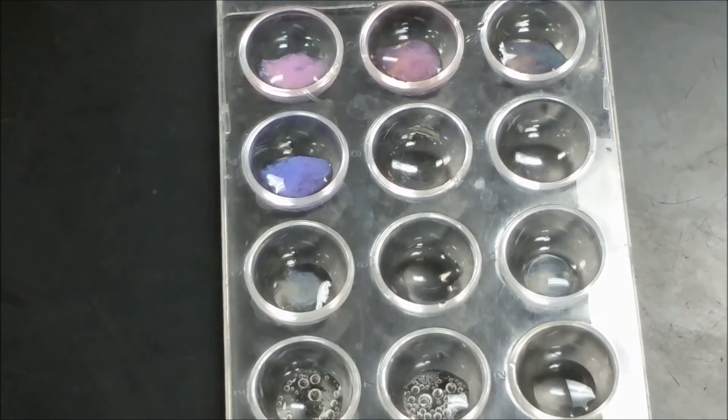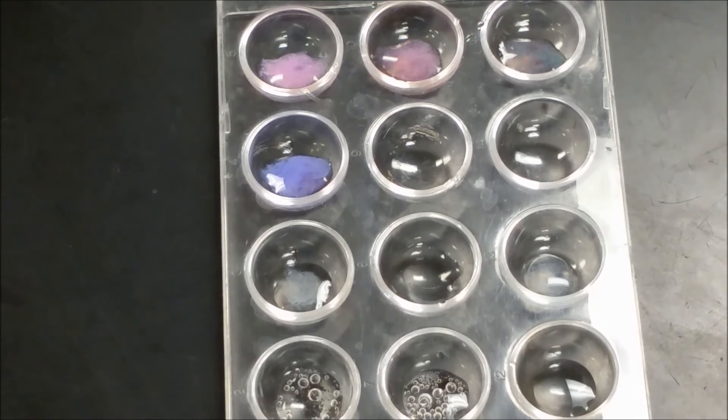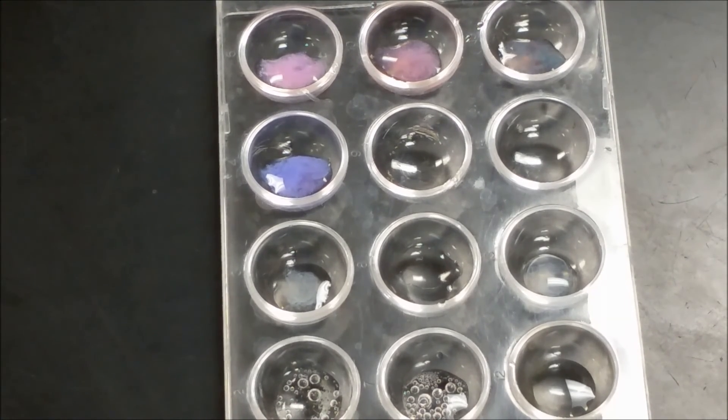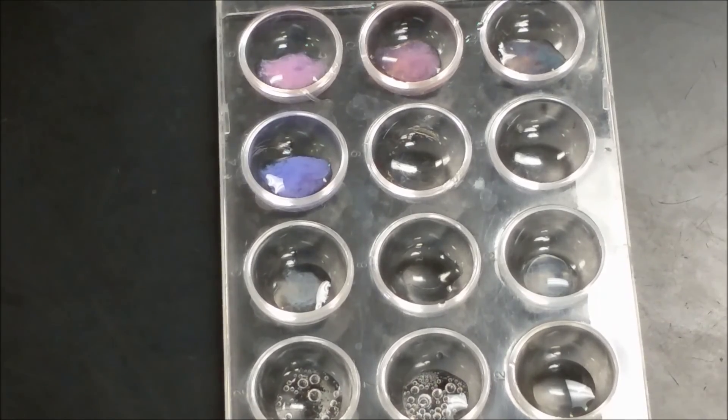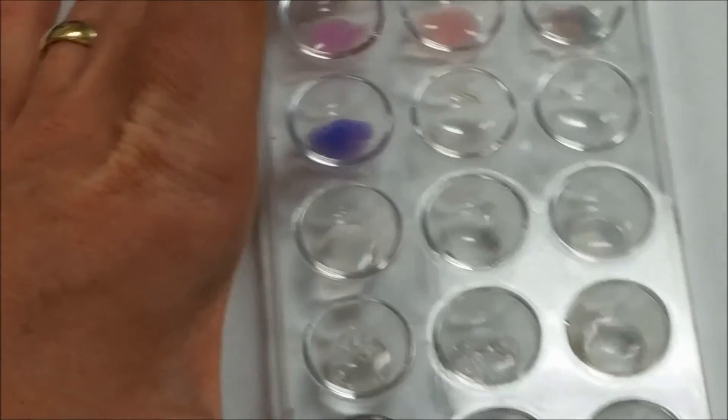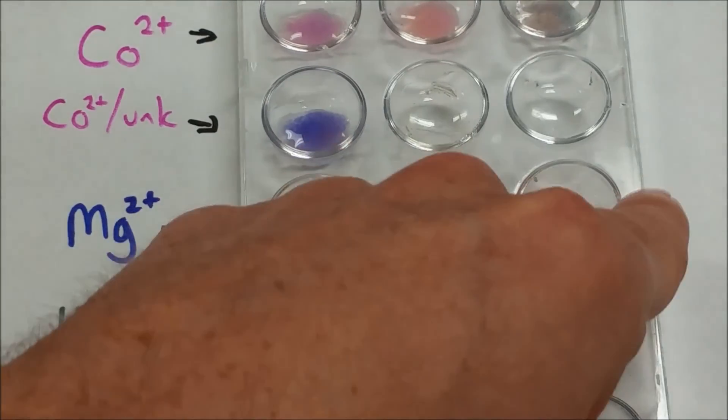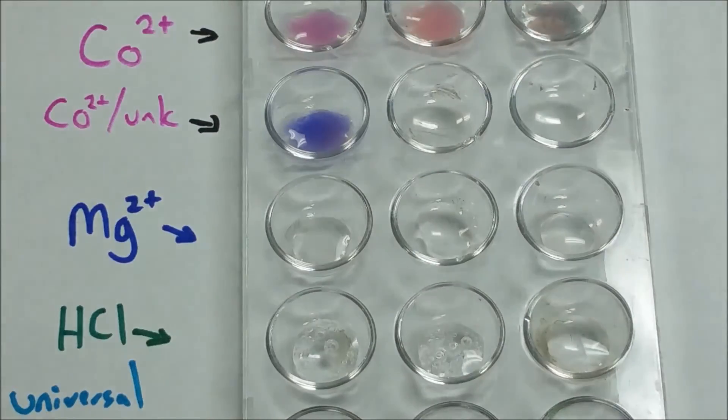So between all four of those tests, you should be able to come up with a good idea of whether you have one of the three in the first place, and if you do, which one that it is. But you really have to look at all of them, and you have to really analyze what's going to rule things out. If you match hydroxide here but not here, then that's not a hydroxide.